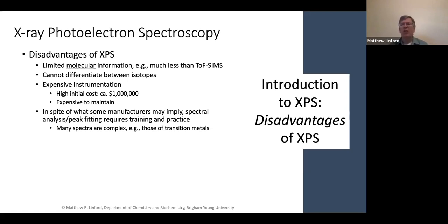In fact, we're going to get to this a little bit later, as I mentioned. The fact is that while some spectra are relatively simple, a lot of them are pretty complex, and it does require a little bit of skill and training to learn how to interpret the spectra. Now, the good news is that really anybody can learn how to do this, but it does require some training and some focus.